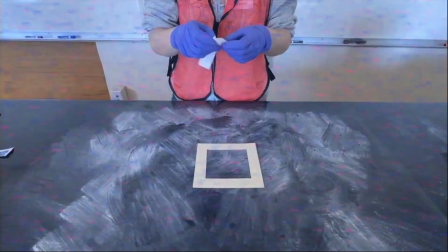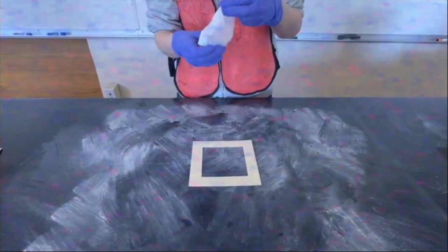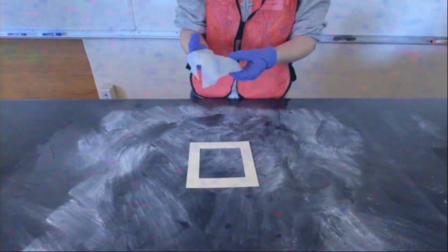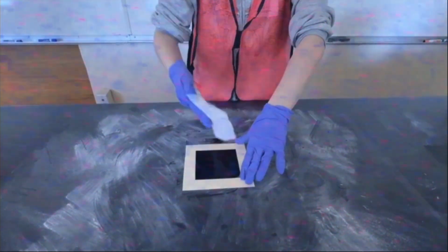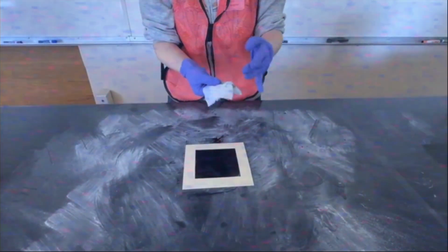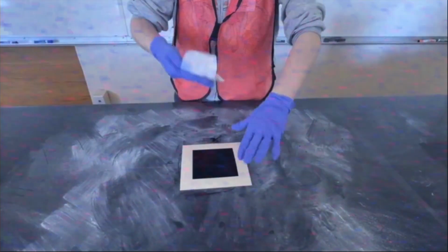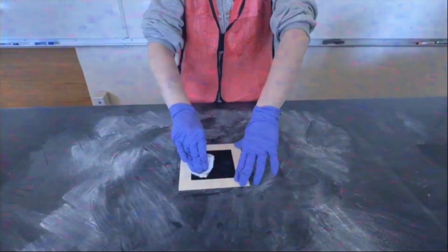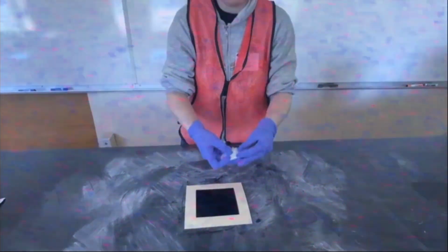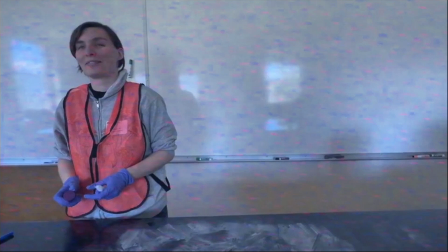The wipe is now prepared for duty. Let us observe the wiping pattern. The horizontal pass, the vertical pass, the horizontal pass again, but the other way. The wipe serves equally in all directions. Notice how the contaminated surface is folded inward after each pass. This helps prevent cross-contamination.